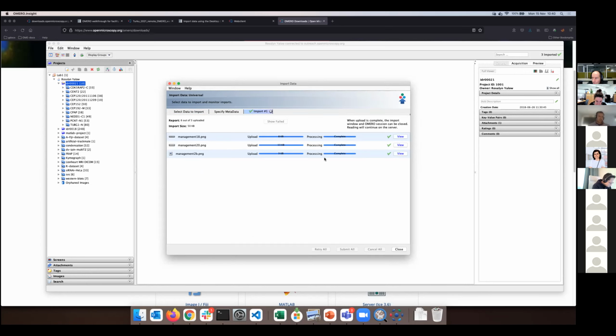So you are doing hopefully the same for yourself. Once you've done that, you would expect them to be in the tree, which is basically browsing the server, but this is not so, because you have to click on the refresh button. This is a feature.